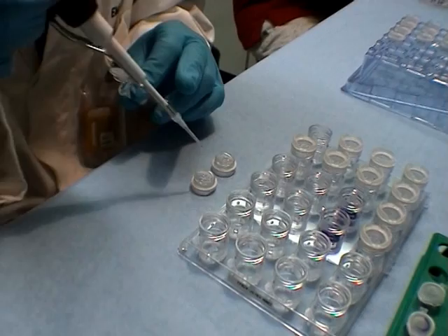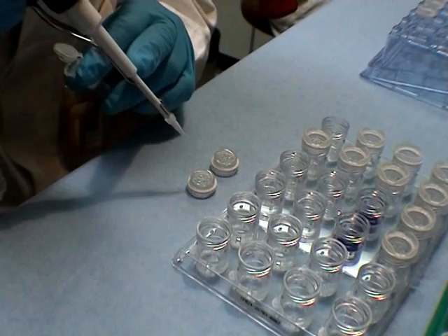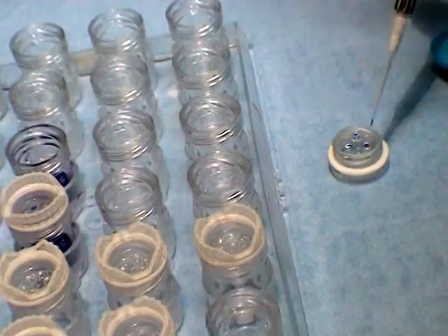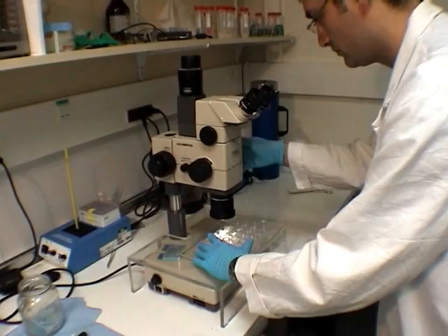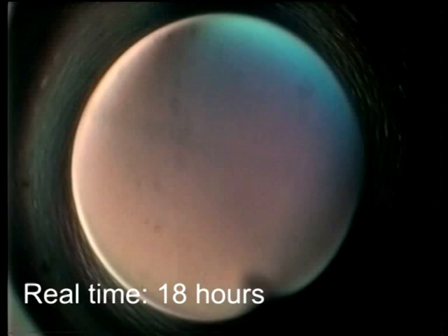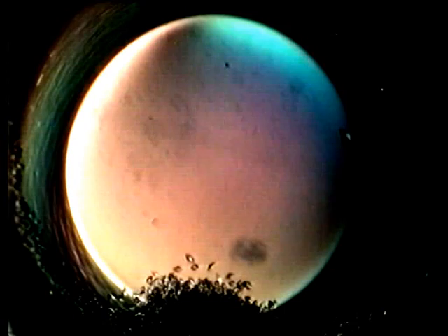Next, drops are prepared by mixing a volume of the solution of molecules with a volume of the crystallizing agent. After hermetically sealing the plate, the concentrated solution in the wells absorbs the ambient water vapor to dehydrate and thus concentrate the drop containing the target molecule and the crystallizing agent. This process of concentration makes the target molecule unstable in solution and causes it to crystallize. The crystallization occurs in a few hours or a few days and can be followed using a microscope.